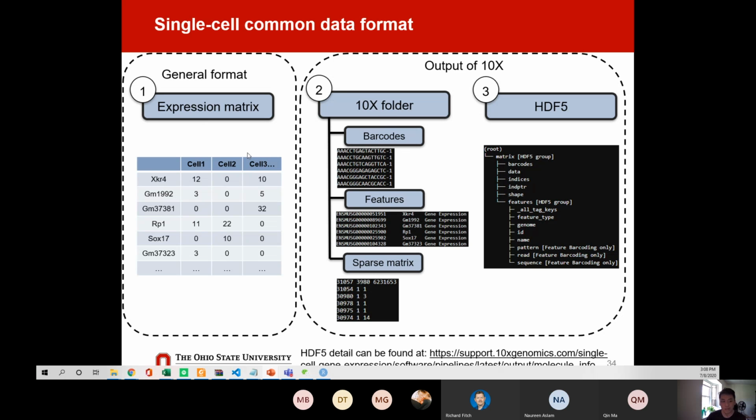However, the single cell matrix has a very critical issue called highly sparse. Yes, it's very sparse, because up to 98% of those values are 0. So if you look at the whole matrix, you will find a lot of 0 inside it.